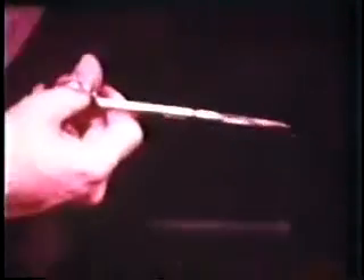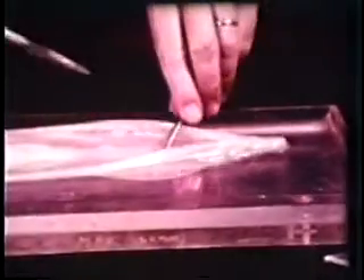The next step, of course, was the removal of a living stellate nerve, and this has now become a routine procedure at those marine laboratories where squid are studied.